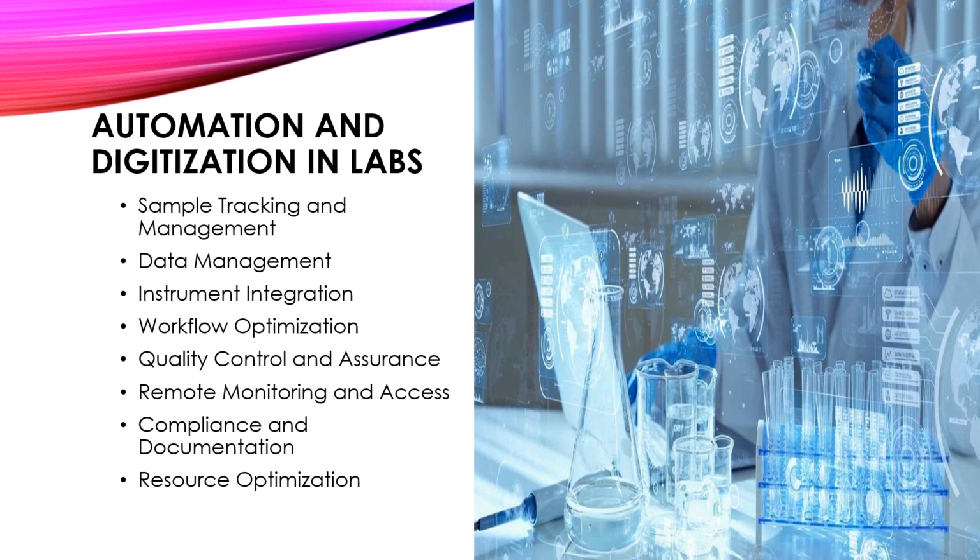Workflow optimization. Now, automated workflows streamline laboratory processes, reducing turnaround times and increasing throughput. Robotics and automated liquid handling systems perform repetitive tasks with high precision and accuracy, freeing up researchers' time for more complex tasks.